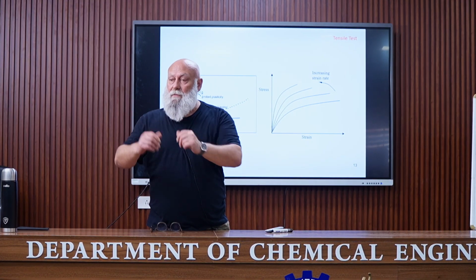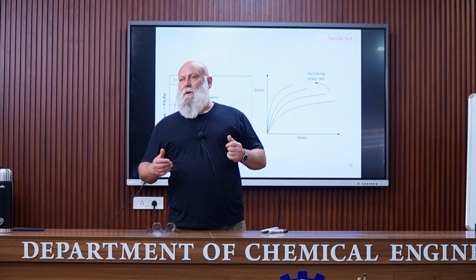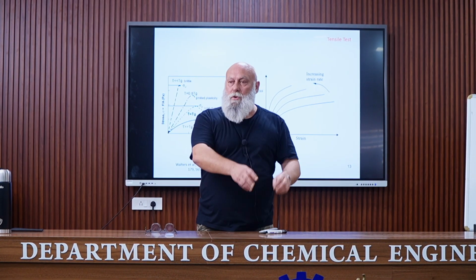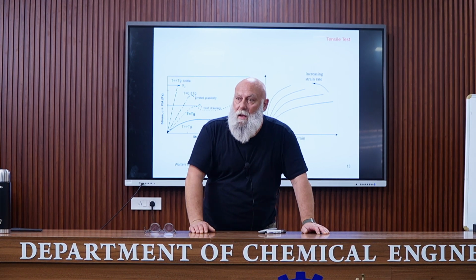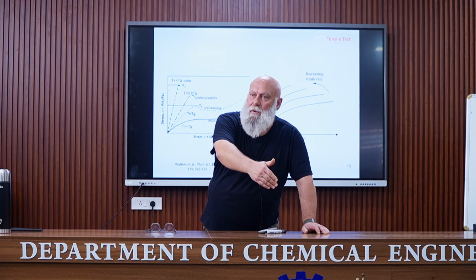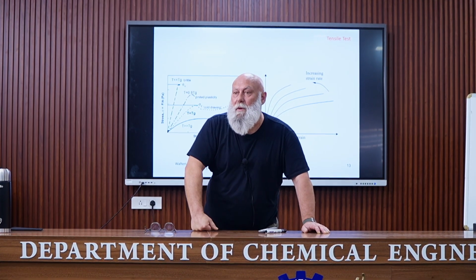This is for the tensile test. Now for DMA, it's a little bit different. We can have other information than direct use properties. I mentioned previously that we can have access to the morphology of the sample. Of course, the morphology of the sample has an impact on the properties, but it's not a direct use property.